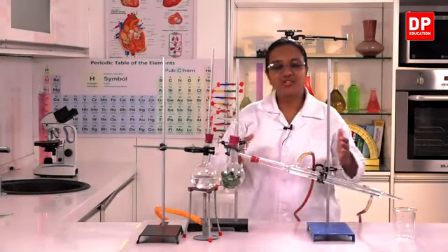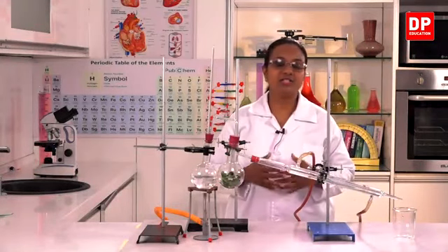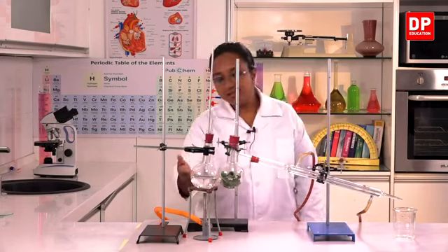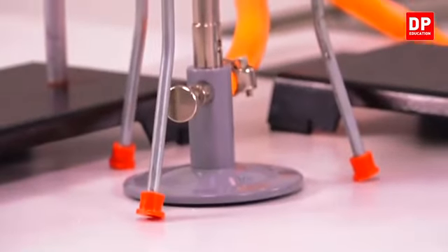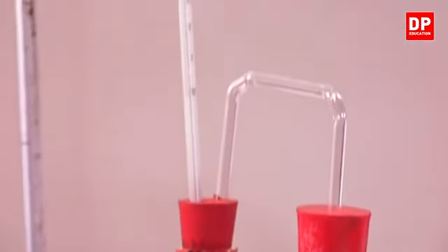Okay students, so now we are going to observe how steam distillation takes place. I have prepared the setup here. You can see the first round bottom flask, and there is a burner under it, and there's water inside, and a thermometer is connected here.